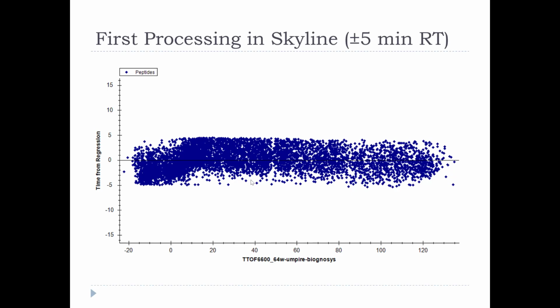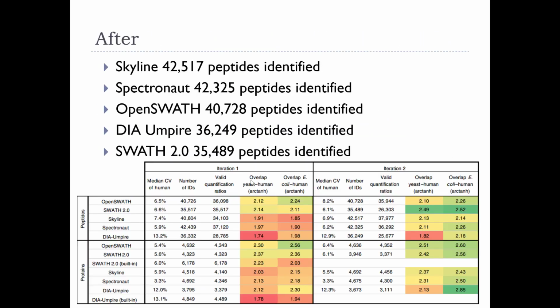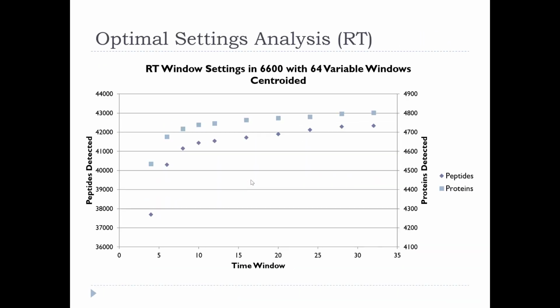Well, this kind of seems to be going like this, right? And then there, yeah. It kind of looks like it's cut off, right? So to me, I want to go back to 30 minutes or something to just see, because I've already proved to myself here that 30 minutes works just fine. So let me just open up the window a little bit and see what else is out there.